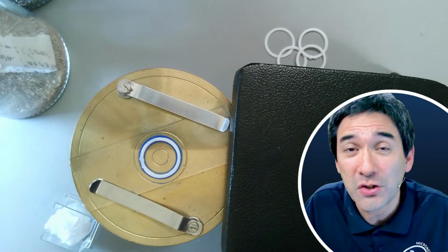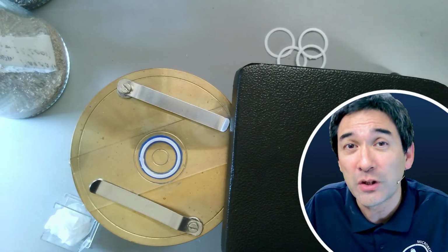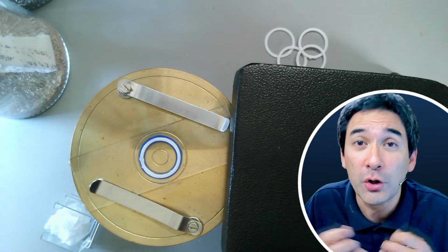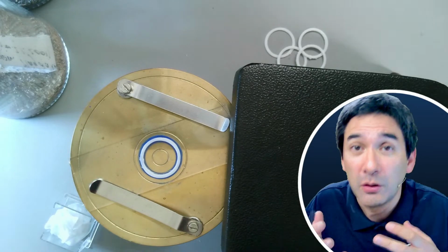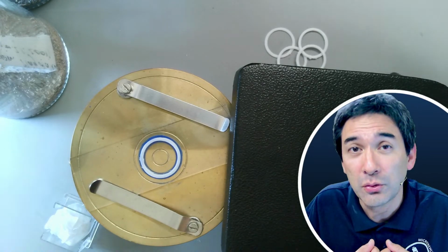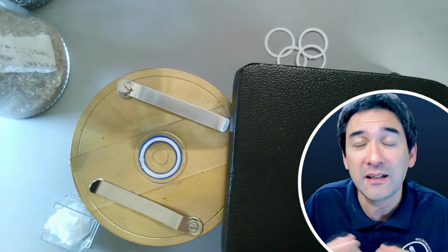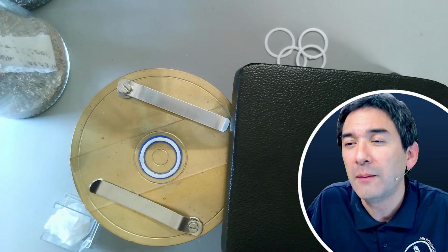The whole thing starts to become bad and smelly as it decomposes. So you have to make sure that there's always enough oxygen present, and that the other larger microorganisms like the ciliates, amoeba, all the protists, are able to grow well because they feed on the bacteria. So it's a delicate balance. Do not overfeed.